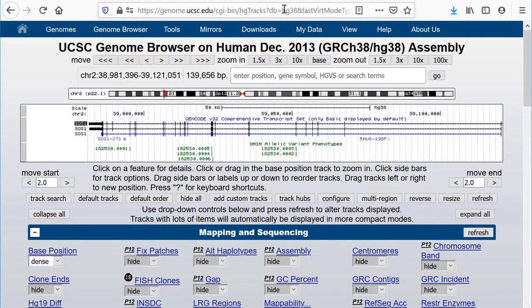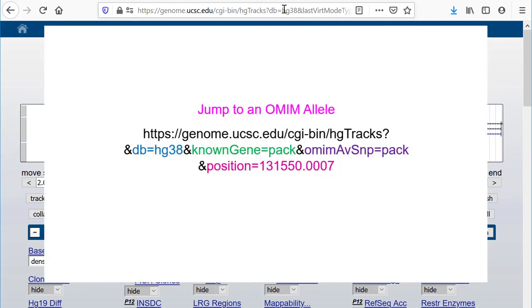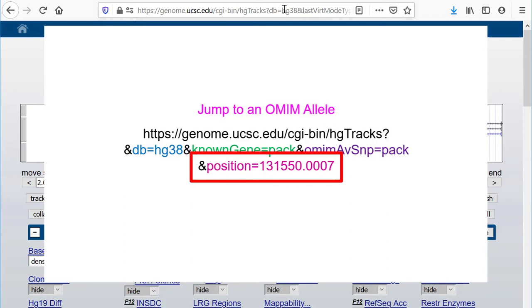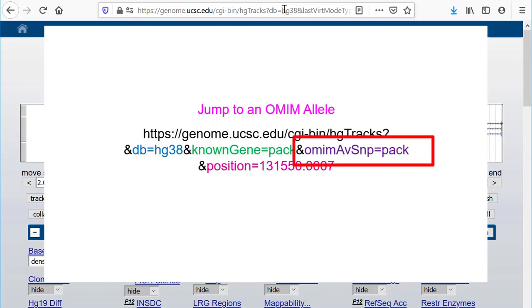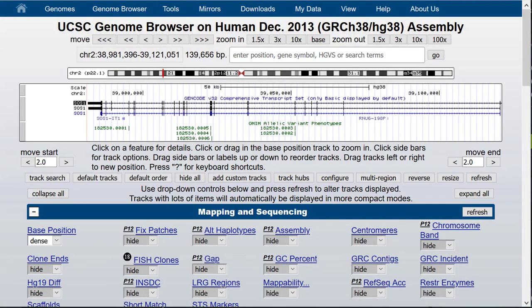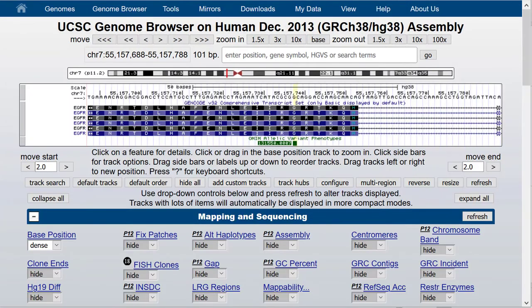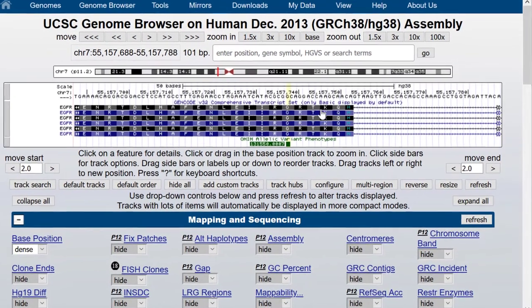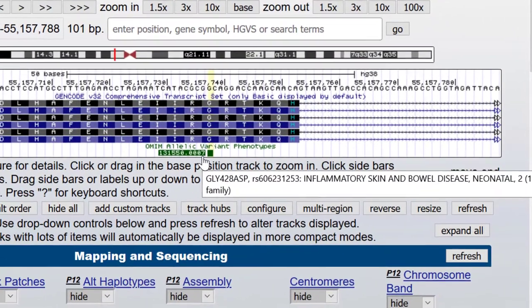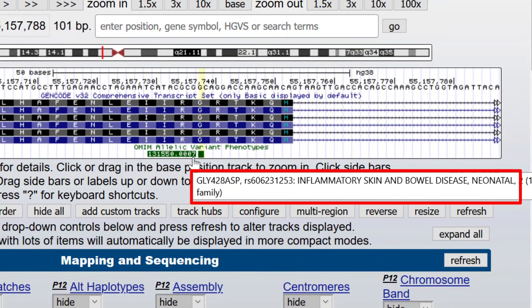Many identifiers can be used with the position parameter directly. If the format of an identifier is unique to a track, such as the OMIM allele identifier, you can set the position to it directly without the singleSearch parameter, such as ampersand position equals 131550.0007. If hideTracks is turned on, you should name the table because tracks will be turned off even though you arrive at the correct location. The mouse-over shows you what this is: glycine to aspartate at amino acid 428 causing inflammatory skin and bowel disease, neonatal. Note that the searched-for item name is highlighted and has 50 bases of padding on either side.